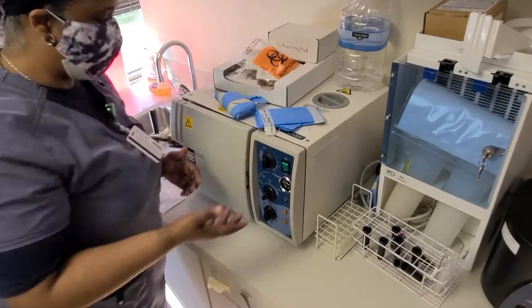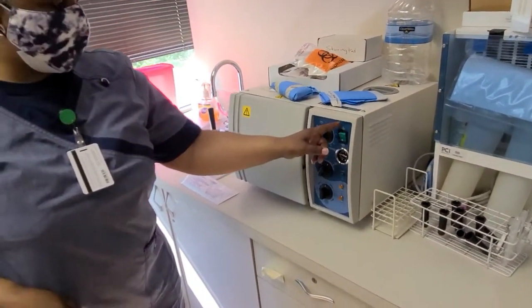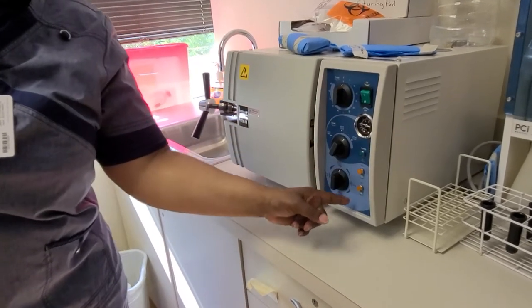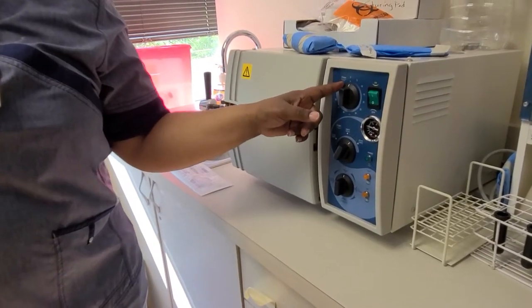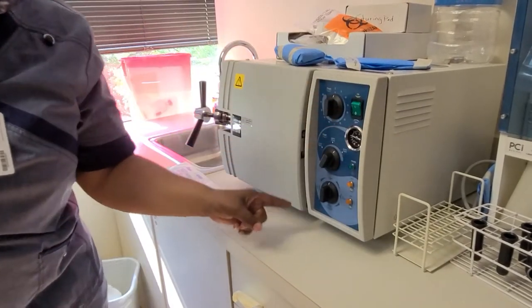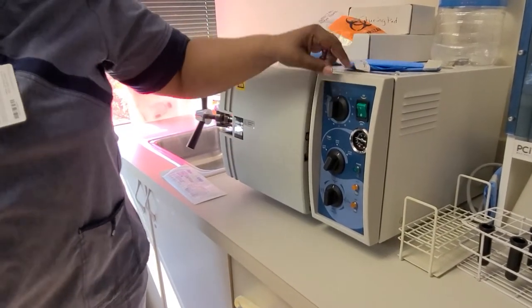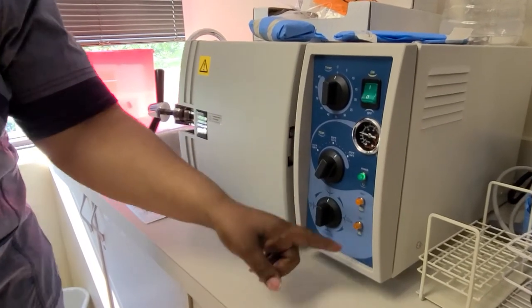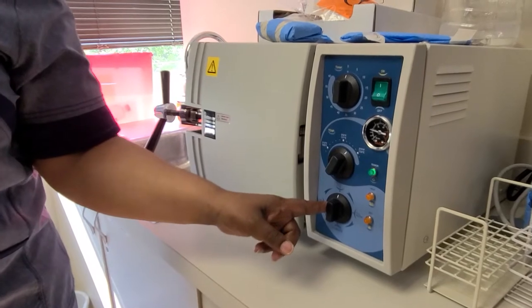And it's a pretty simple process. You basically are going to go from here, this side. You go from the distilled water, you go here, you come down, and then go up on this side. So you don't have to overthink it, right? So I put the distilled water in. I'm now going to turn my machine on. I see the light has turned green. I'm now going to go to this part here, okay?